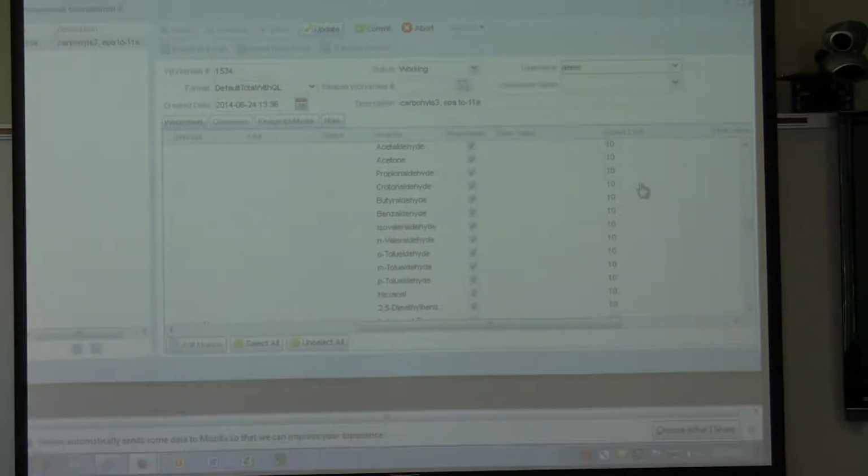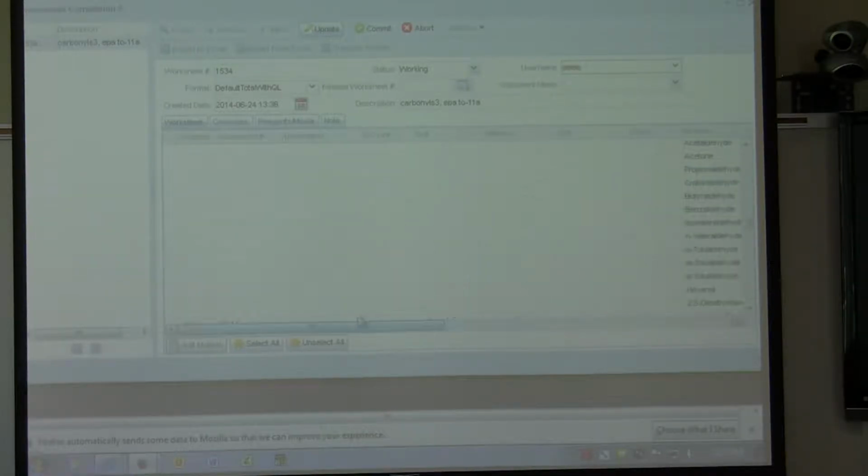Because it selected everything. But that's not necessarily what we want, because not every sample has dilutions, right? So then we have to uncheck. You'd only have to select the ones you want to change. Okay. So that's how edit multiple works with the select all and select all.